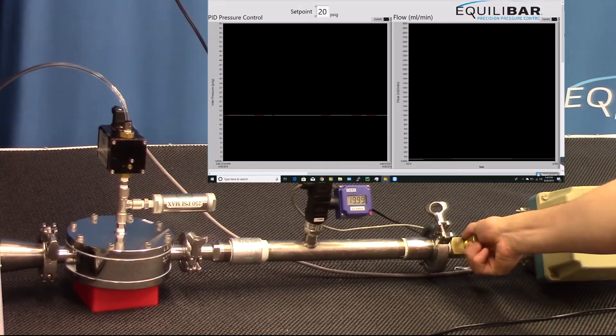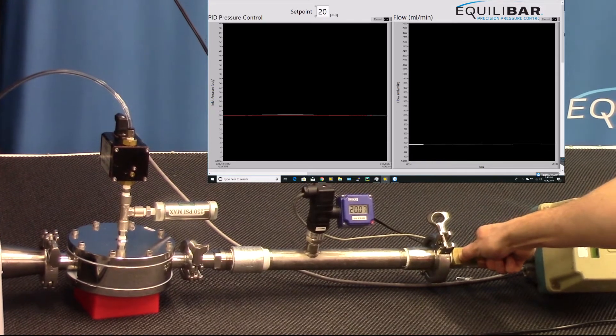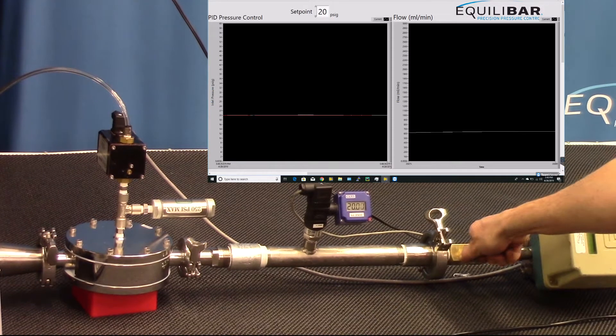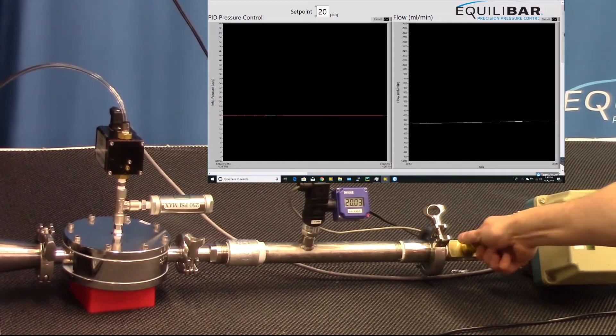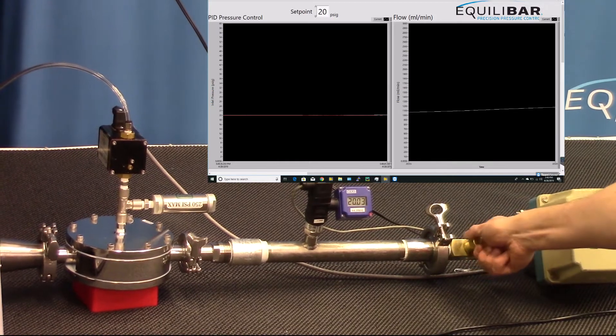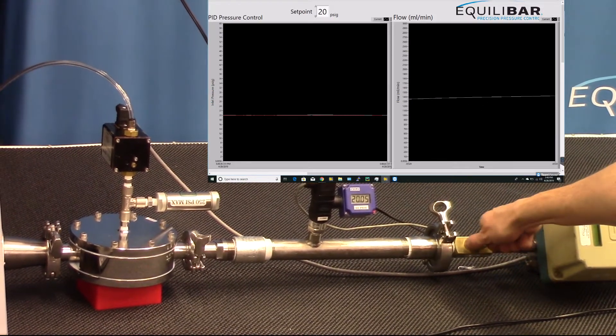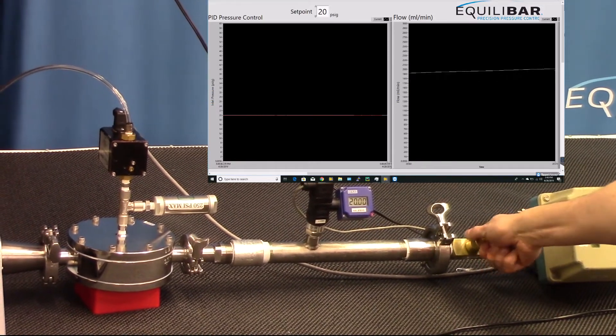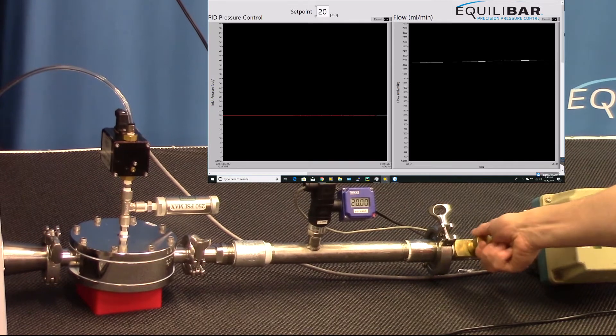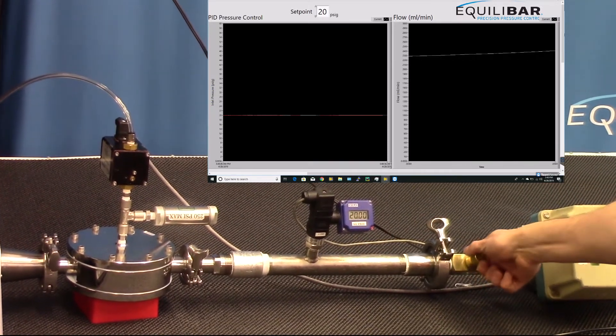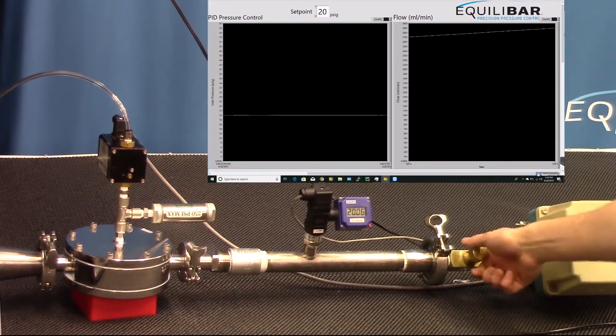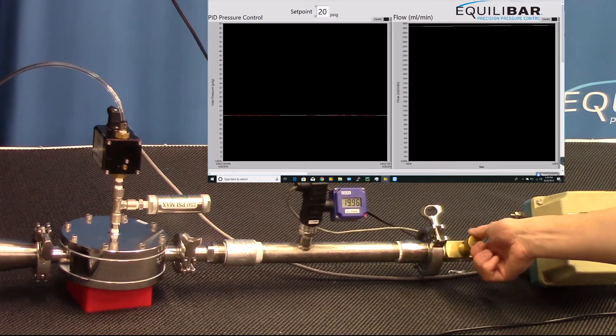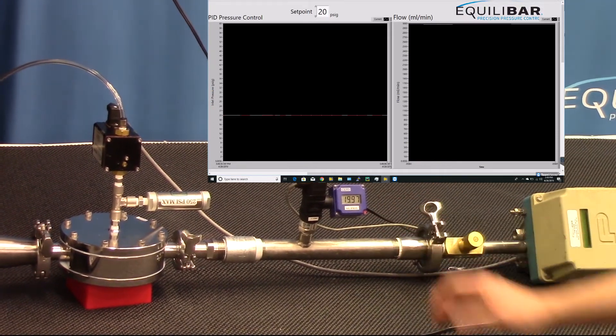We're slowly going to ramp up flow, and as we do, we will see the Equilibar demonstrate stable pressure control. As we approach one liter a minute, we see that the inlet pressure has not changed. We will again slowly increase to almost three liters a minute before we max out the range of this flow meter. Now we're reading at about three liters a minute, and we can see the inlet pressure has not changed.